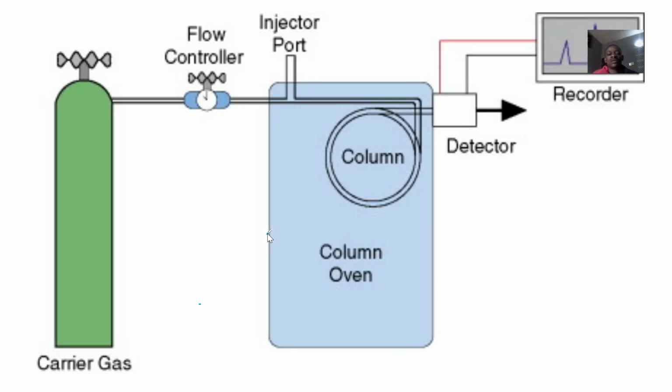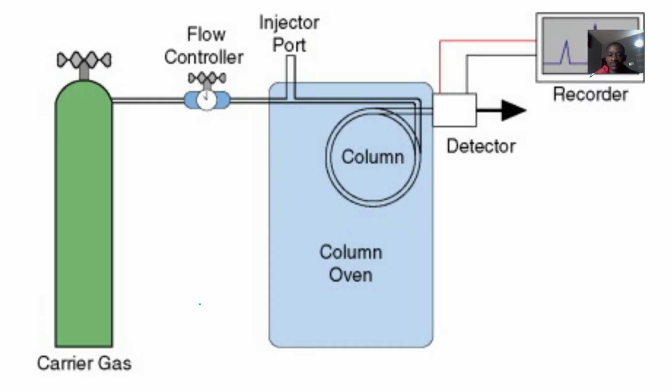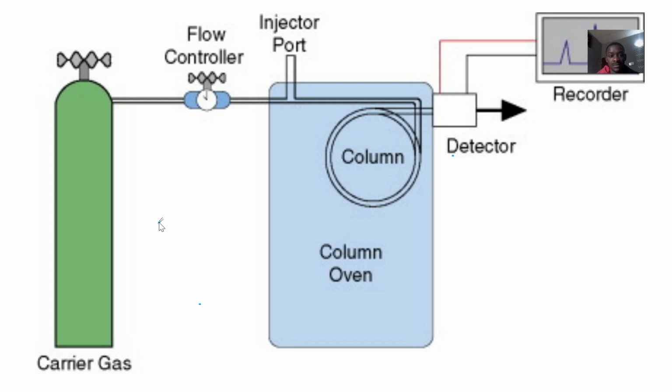The last one is gas chromatography. For gas chromatography, we said that movement of particles is based on their size, molecular weight and charge. A liquid sample is passed through a matrix that differentially separates its constituents. The matrix separates the constituents.